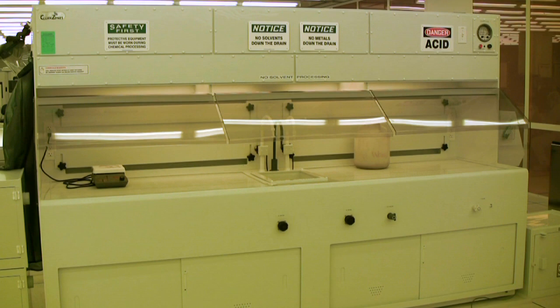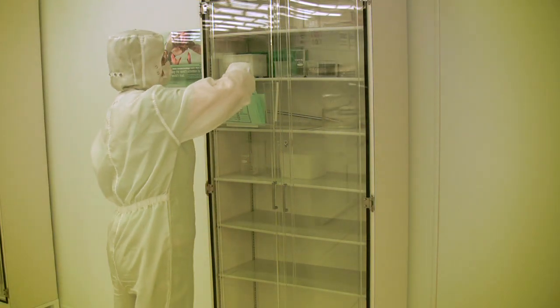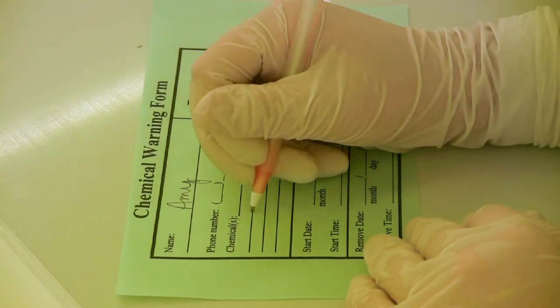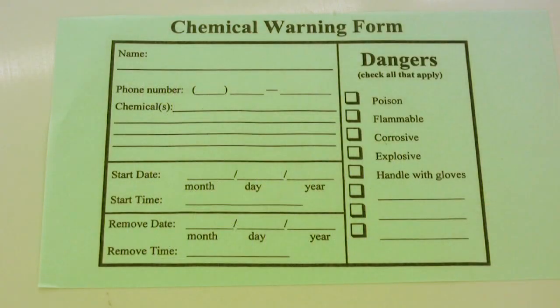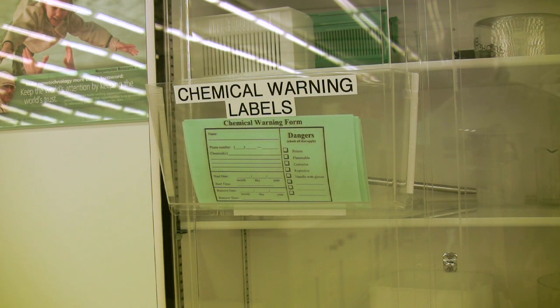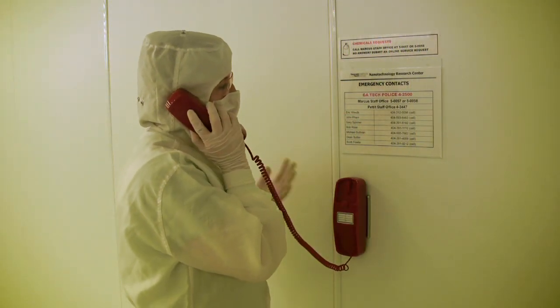Once you are confident that a fume hood is clean enough and safe enough to work in, you may begin prepping to pour your chemicals. The first thing you should do is fill out a chemical warning form, to prevent any confusion over what a chemical is if you need to leave the area. You will need to fill one out for each chemical or solution you intend to use. The chemical warning forms are green in color and can be found on the fume hood shelving units and on the door of one of the labware storage cabinets. If you are unable to find one, please notify the cleanroom staff.